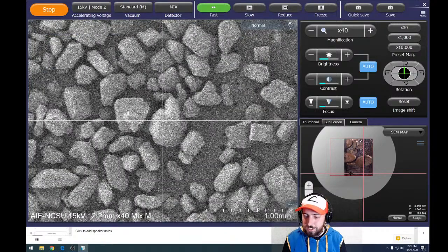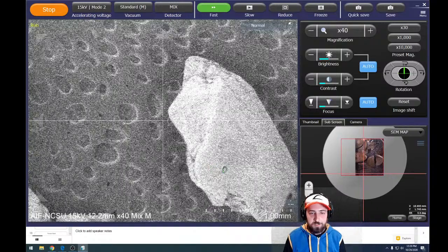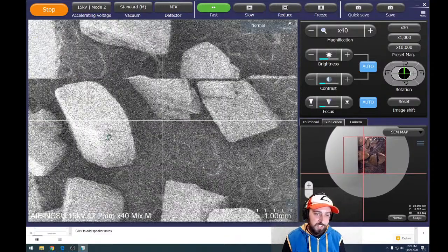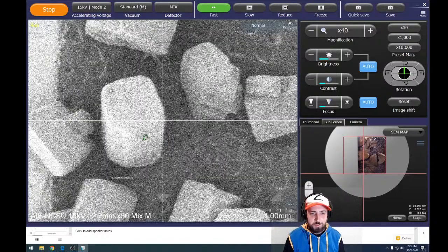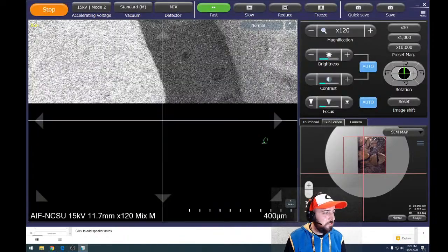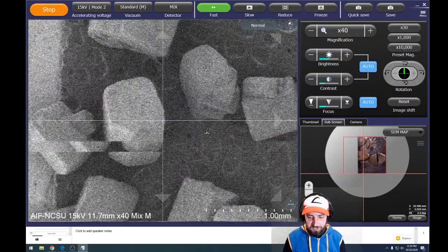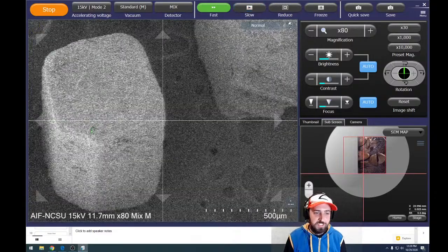Now let's go look at the turbinado sugar. As we move over, think about how many crystals you saw in a single area on that one. As I move over to the turbinado sugar, I have it a little bit less dispersed because I didn't have as much with me. But still, I think you'll notice a difference in the size. All right, so let's get back to the same magnification. What was it, 80? All right, we're back at 80 magnification.